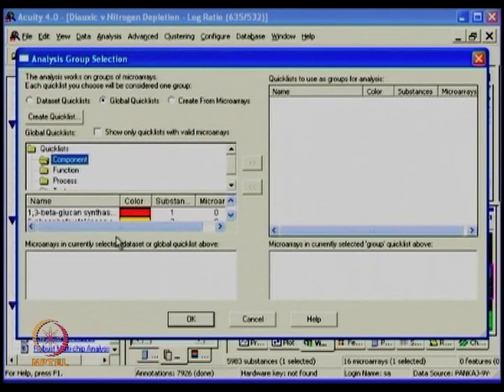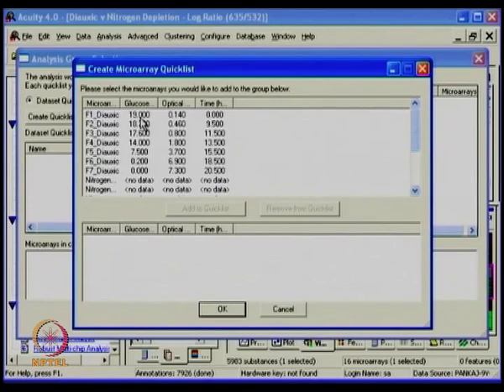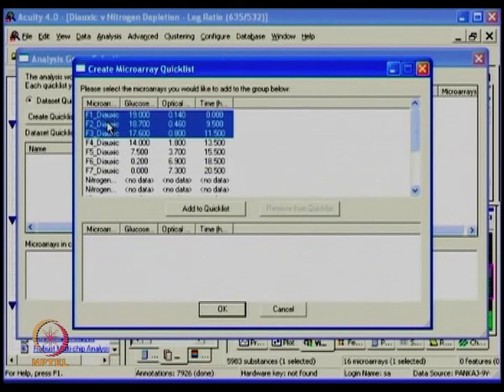This data is based on different kinds of components and functions. I want to understand the differences between the different functions, or you can quickly create a data set. So I can create a data set from whichever ones you want. I said okay, create a data set from all these different time points we can select.